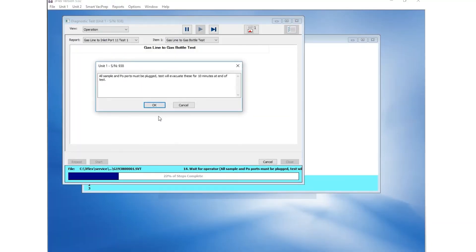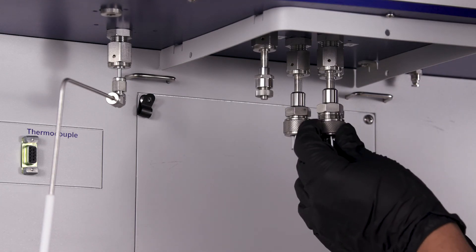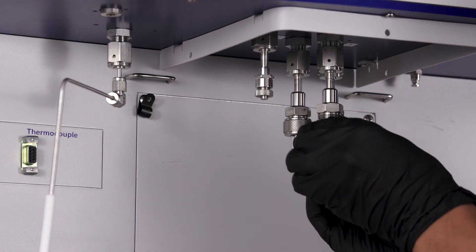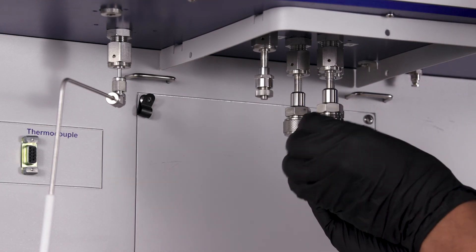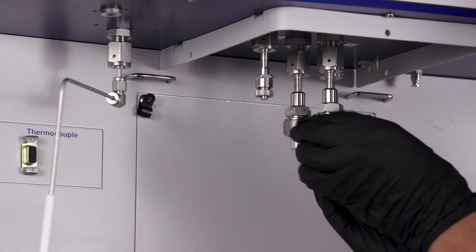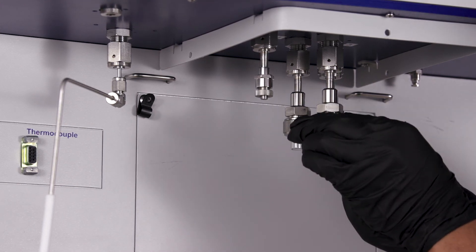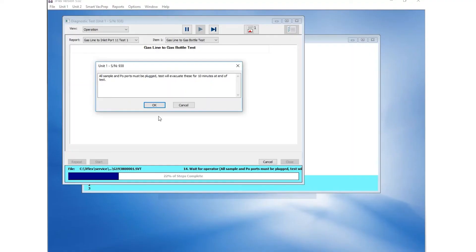Empty sample tubes or plugs can be used to plug the ports, and if a P0 tube is installed, it could be left as is. Click OK once completed.